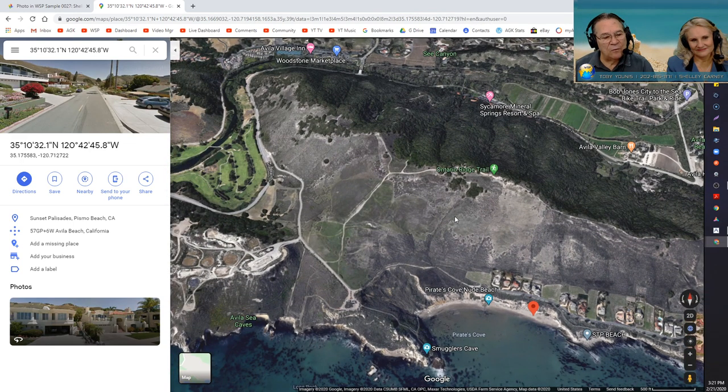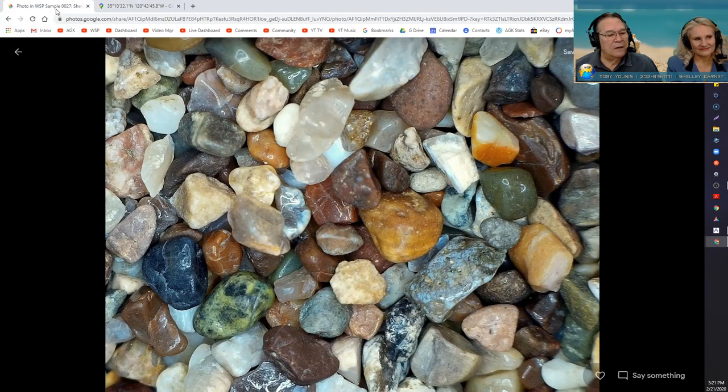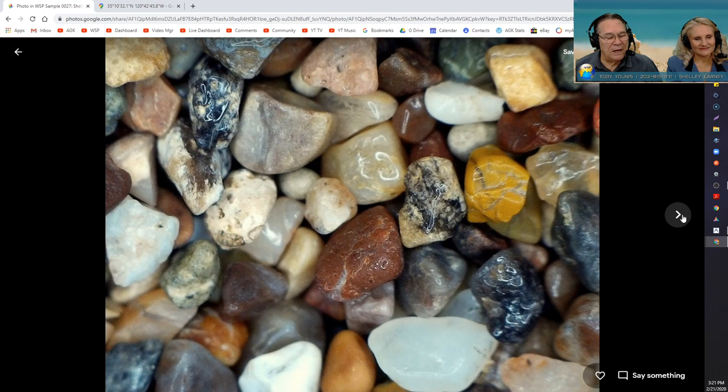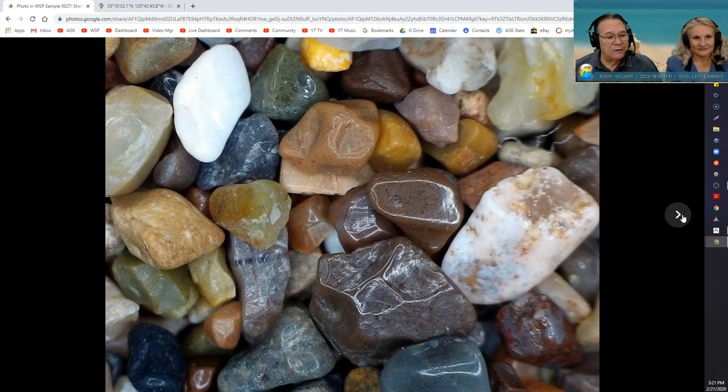And you can see where this is weather-worn on this side. So a lot of that rock material is dark. It isn't basaltic dark. I wouldn't call it volcanic dark. But a lot of that material from here, here, and here is ending up on that beach. And I think that's why we have so much rock in our sample rather than shell material or forams like we've seen in the past. And, of course, it has the polish of being weathered by being tumbled in the ocean, being drawn into the ocean, and then being tumbled by the waves to give it that nice little polish.